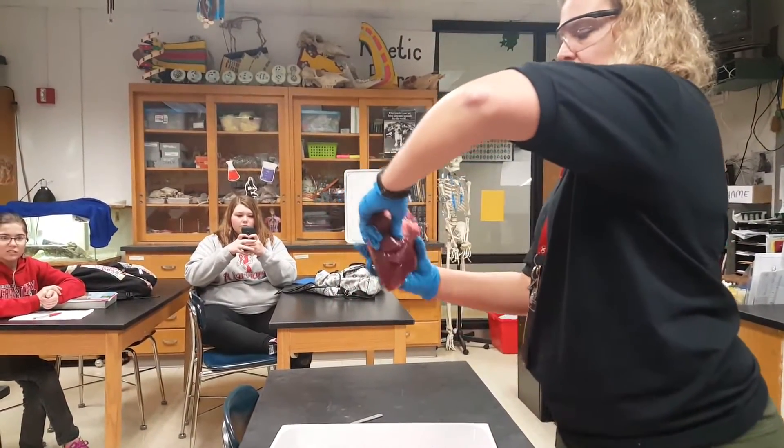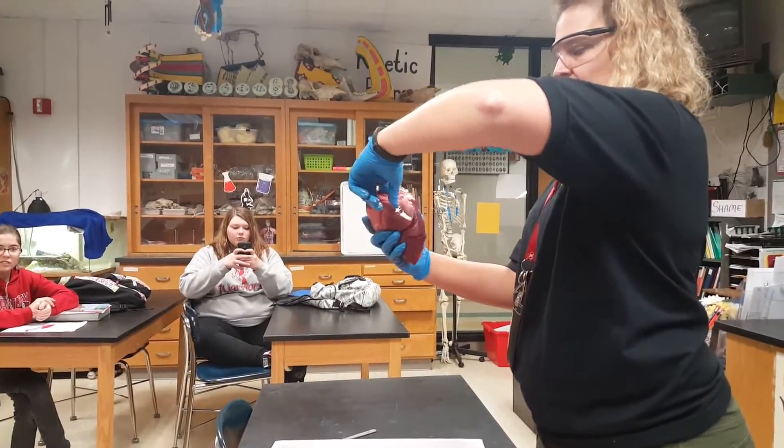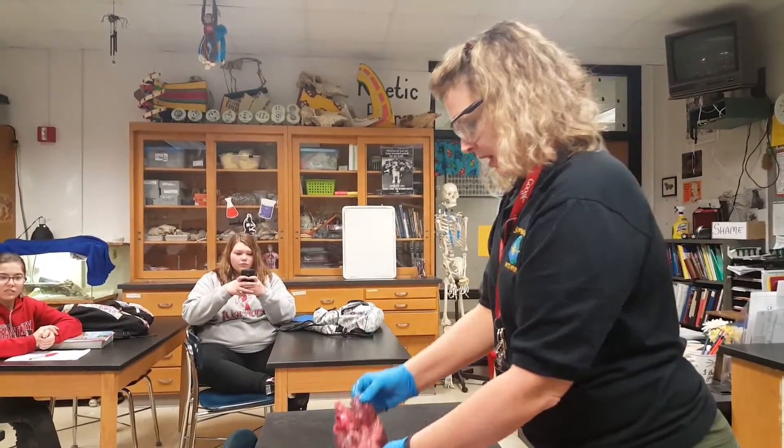This is the left side of the heart on this. So what's my finger in? Pulmonary vein. And then on the right side, there it is — that'll be the vena cava.